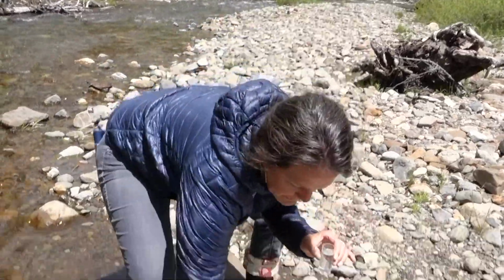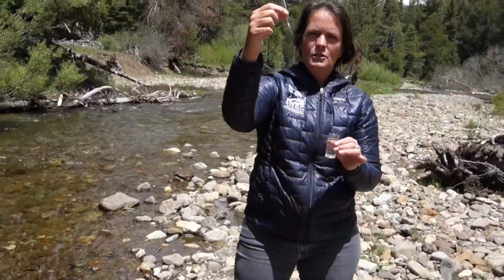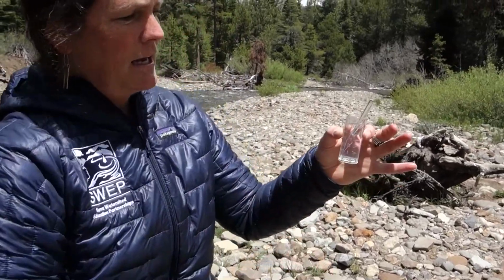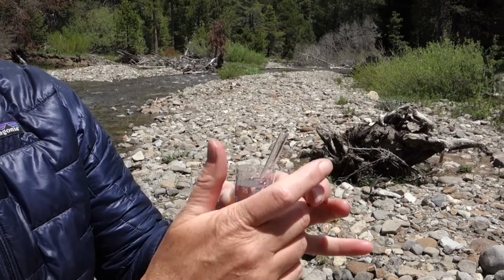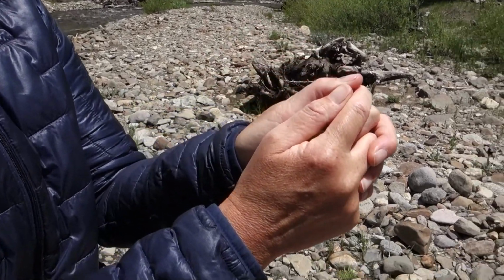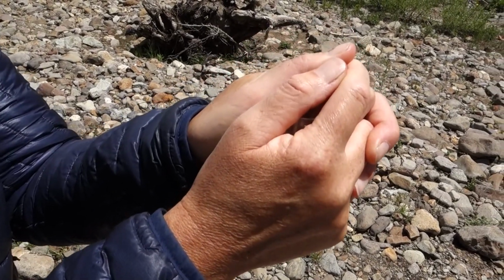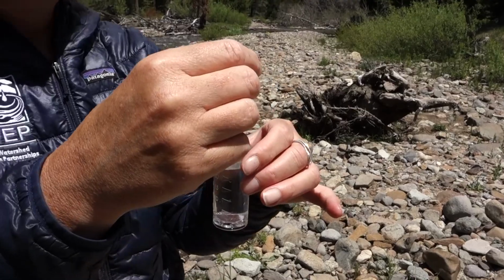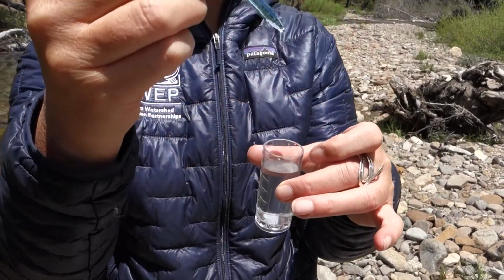And this is the fun part. What you need to do is break off the tip of the ampule into your sample cup. And the way you do that is by carefully pushing your thumbs together, down and sideways on the cup. So you hear that snap. And then that breaks the tip off. The water from the creek gets sucked up into the ampule.